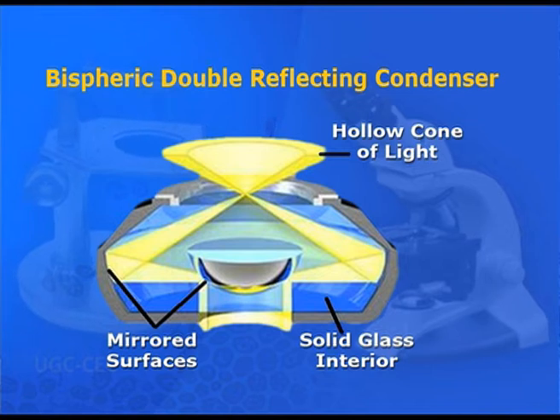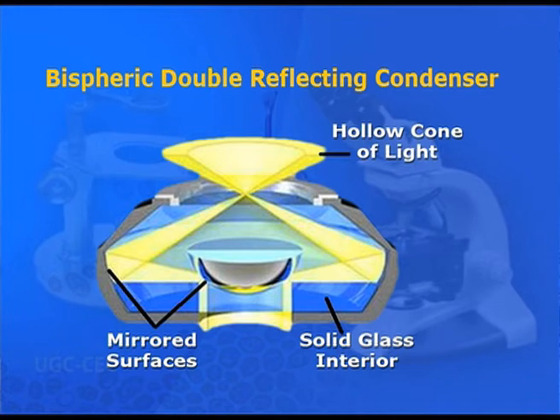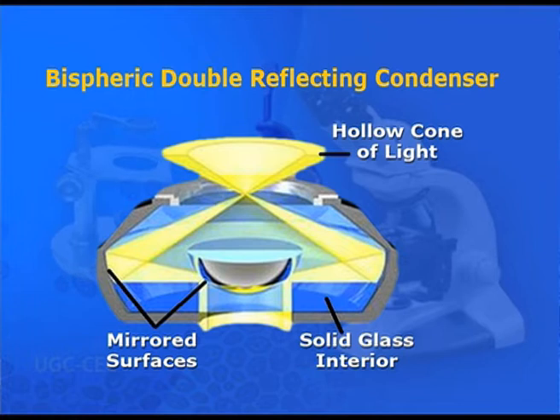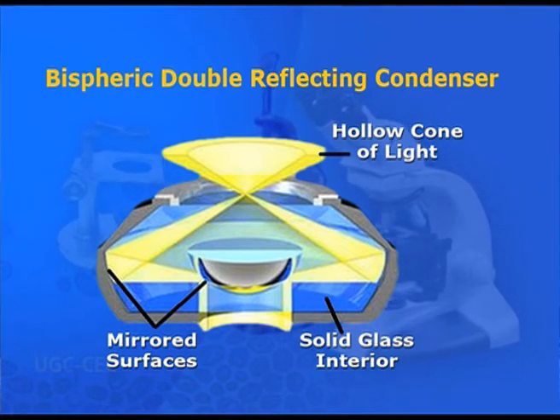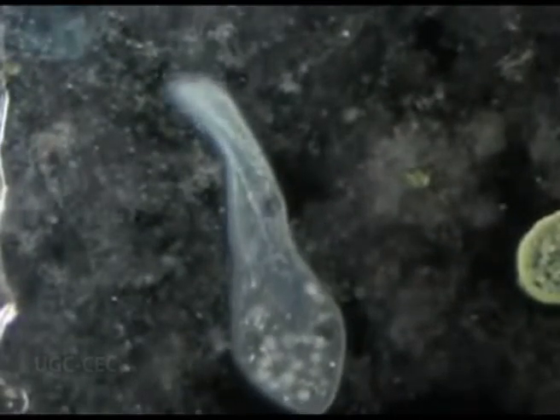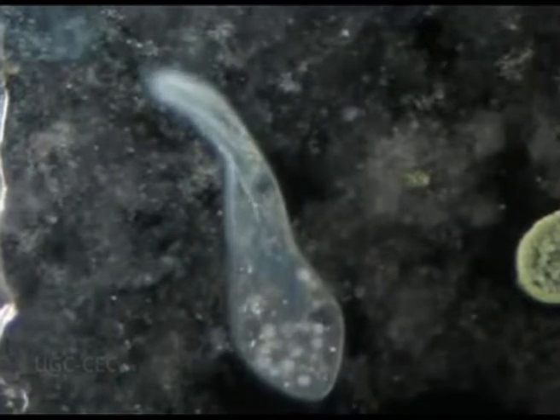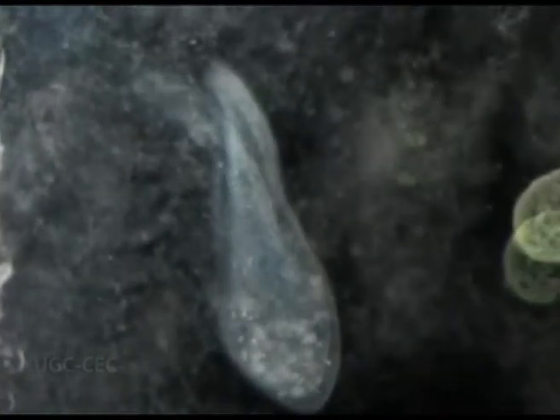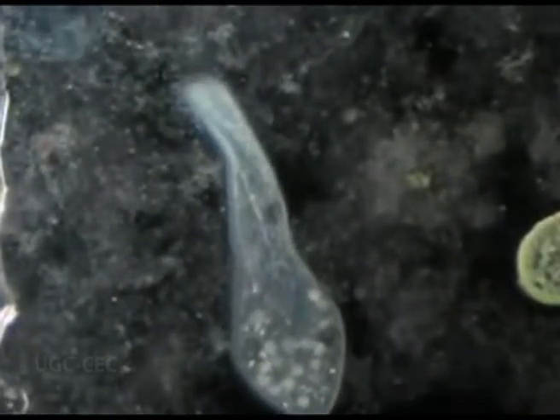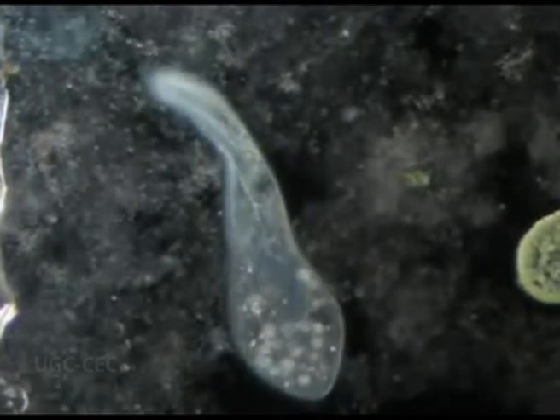As it employs a higher numerical aperture, the magnification and the contrast achieved by dark field microscopy is quite impressive compared to bright field microscopy. Apart from this, we do not need to stain the specimen to obtain the contrast, and hence it enables us to visualize live cells with detailed images. It is exceptionally good for observing motility of cell structures like cilia and flagella.